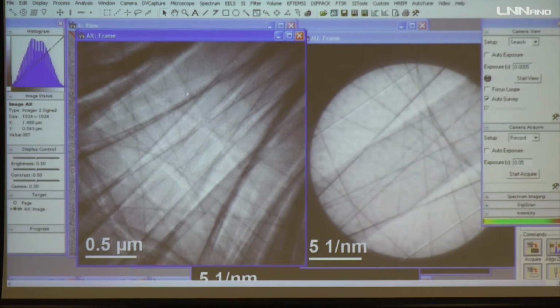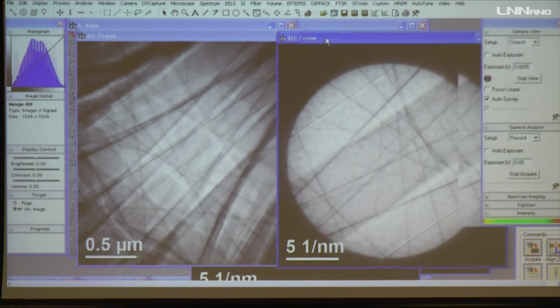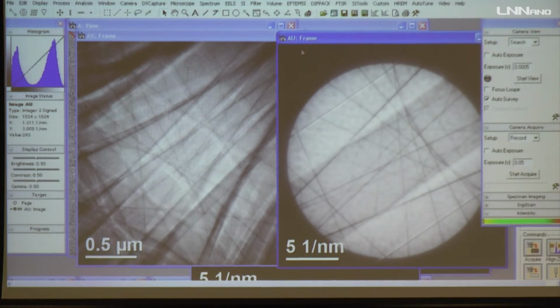But unfortunately, apart from that good analysis, the visibility of these Holz lines is really very bad compared to this one. So this technique is more for understanding how your Holz lines behave within fractions of a second. But here we don't have that information, though we have sharp Holz lines. These Holz lines are really very good if you are doing any quantitative analysis.